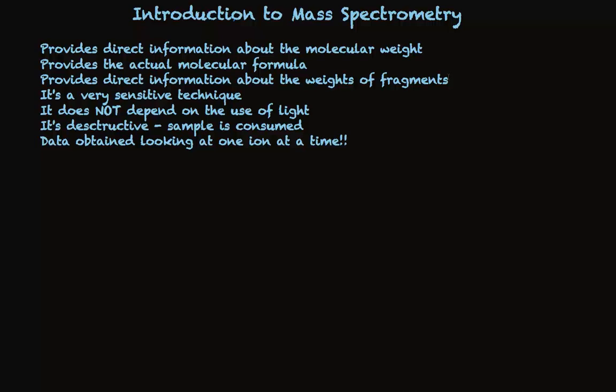And it needs to, of course, look at lots of ions and count them all up to get enough to actually provide data. But those observations are happening one at a time, which again distinguishes this technique from all the others we're going to talk about.